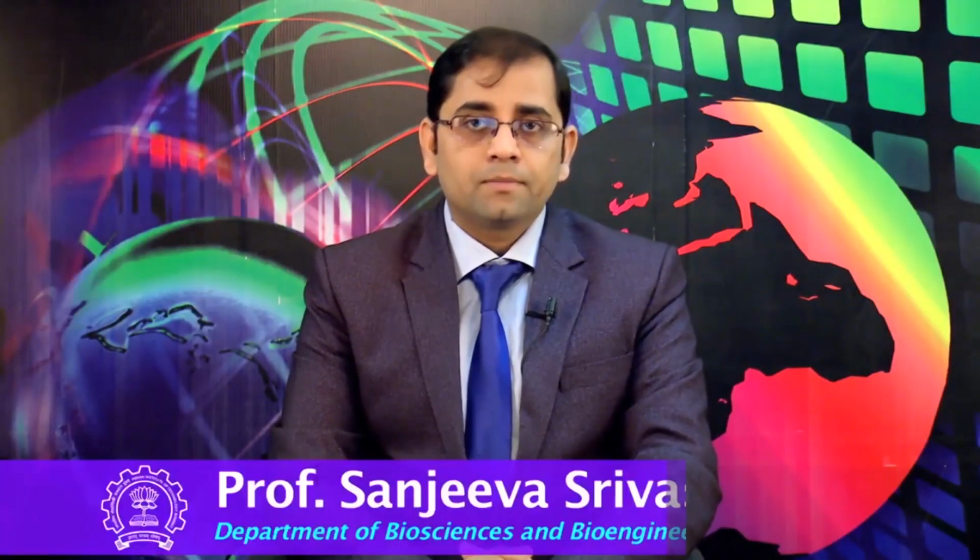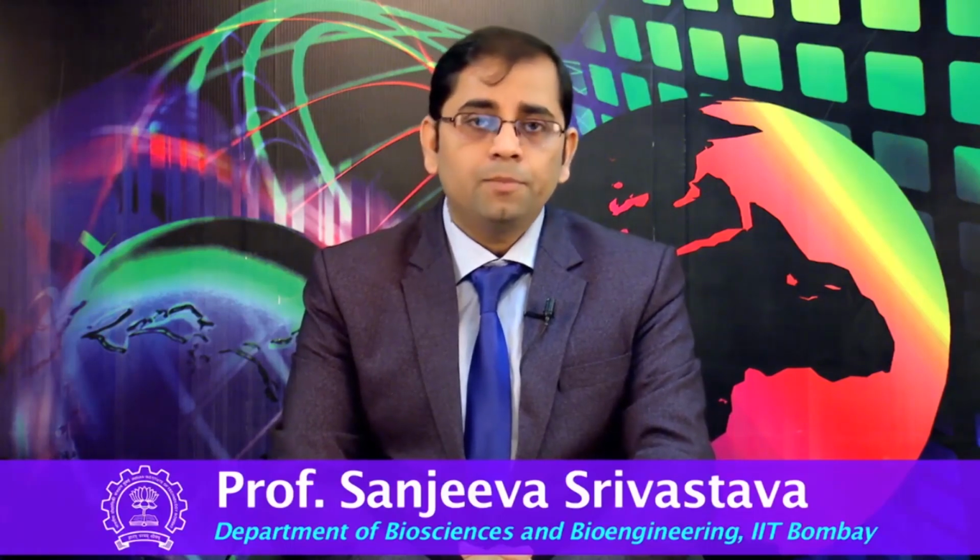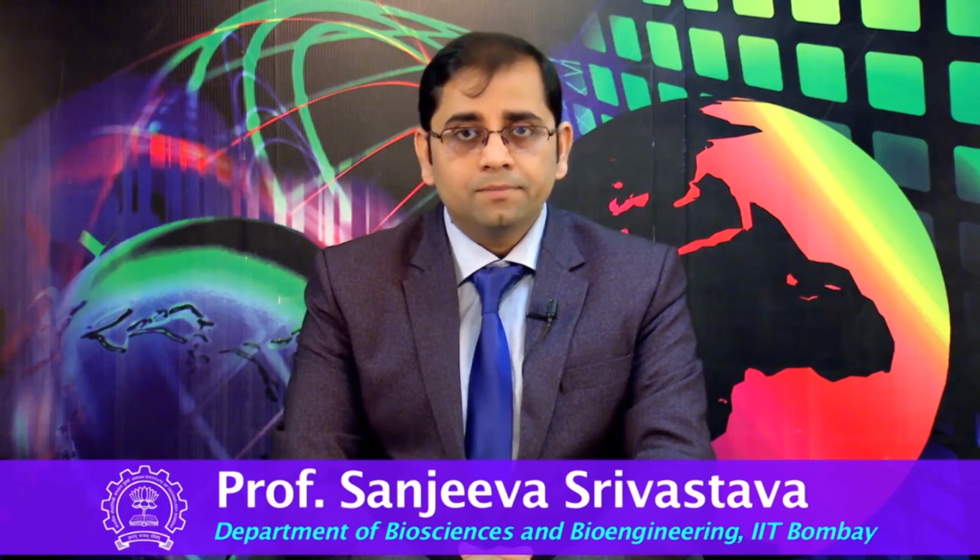Welcome to MOOC course on Introduction to Proteogenomics. In the last lecture, Mr. David Campbell started discussing SWATH Atlas and various comparisons of DIA versus DDA methods. We were also introduced to the concepts of DIA and the software and tools available for analyzing DIA datasets. The SWATH Atlas contains high quality ion libraries for use in SWATH or DIA experiments.